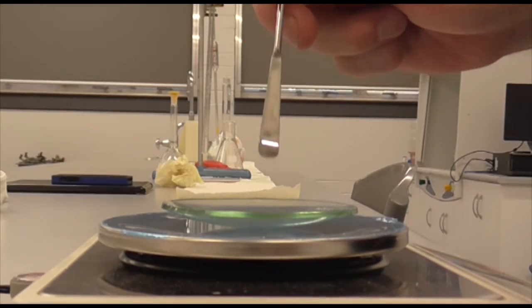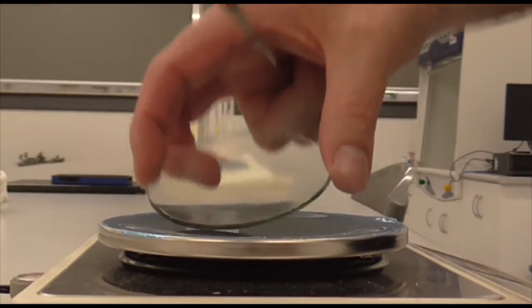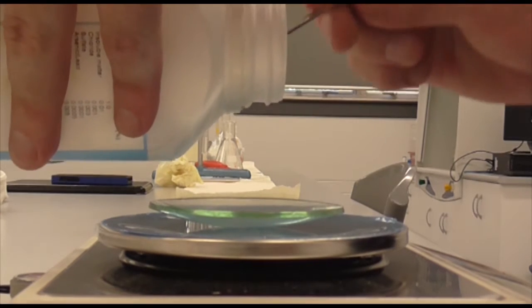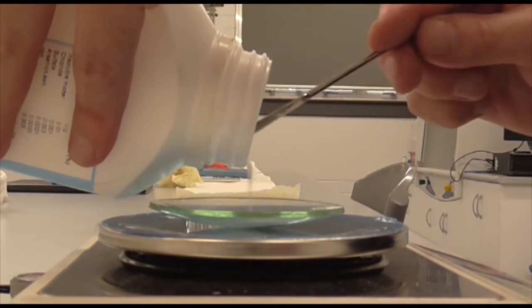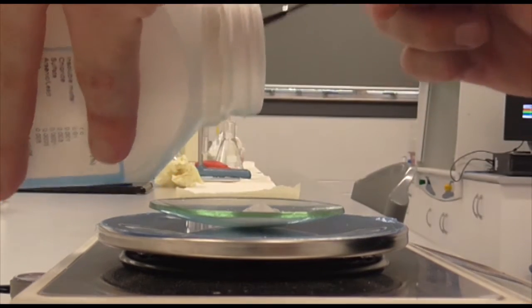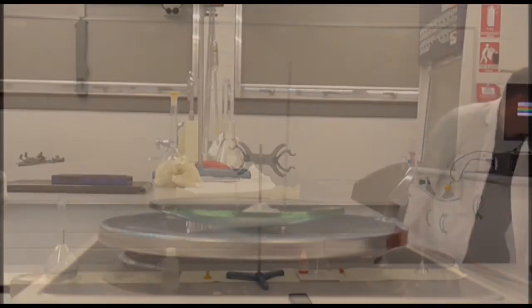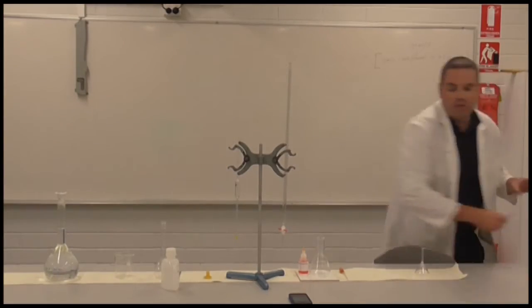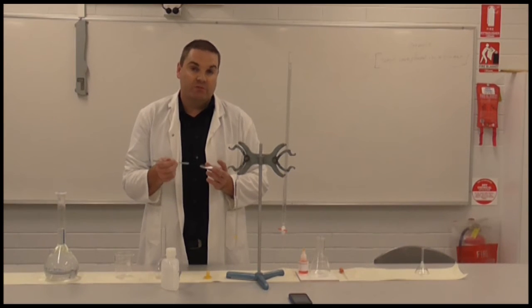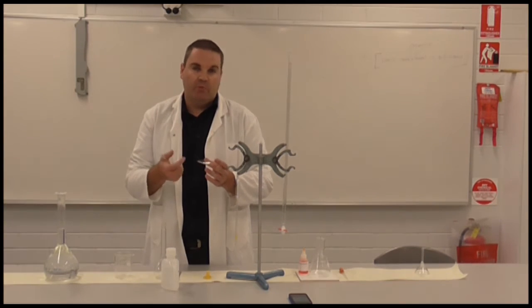What we have here is a clean dry watch glass, and we're just going to weigh out our sample onto it. I'm going to try and get about 1.2 grams. In this case we're going to be making a standard solution of sodium carbonate today. I've got my sodium carbonate weighed out here — this is 1.22 grams.